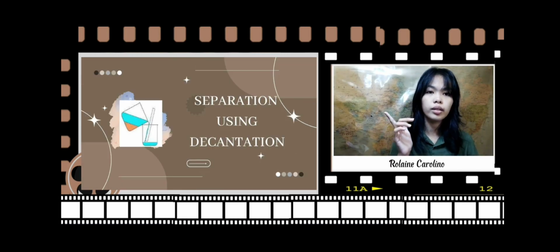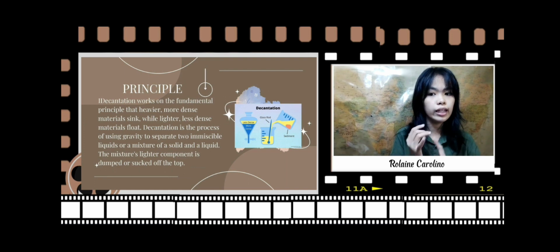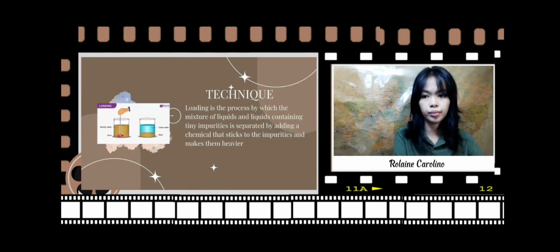Decantation works on the fundamental principle that heavier, denser material sinks, while lighter, less dense material floats. Decantation is the process of using gravity to separate two immiscible liquids or a mixture of solid and liquid. The lighter component is skimmed or sucked off the top. In decantation, the clear upper liquid is poured out from the container without disturbing the sediment.